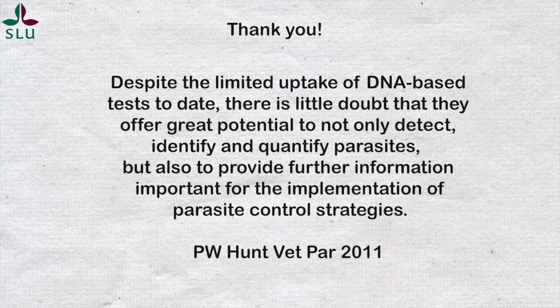After listening to all of this, I hope you have now become convinced that ddPCR is a flexible and simple technology with wide application in our research field. Remember, not until these tests have been put in place are we able to quantify parasites correctly, which of course is important for the implementation of sustainable parasite control strategies.